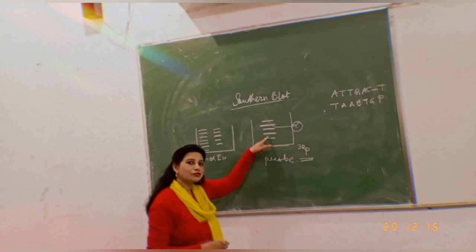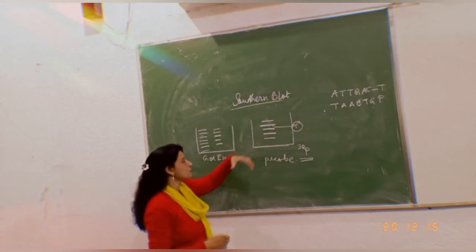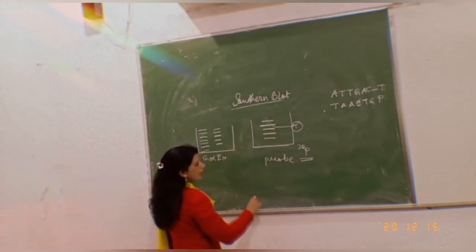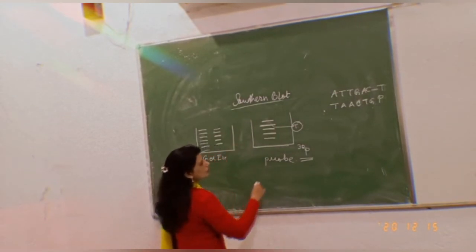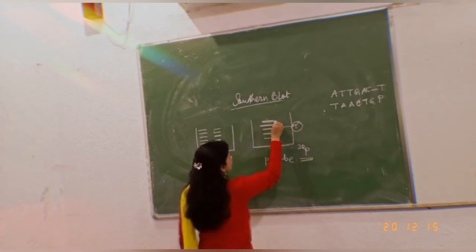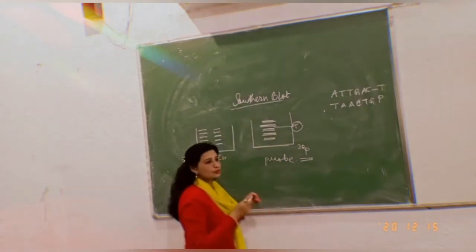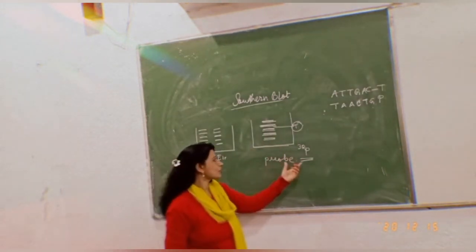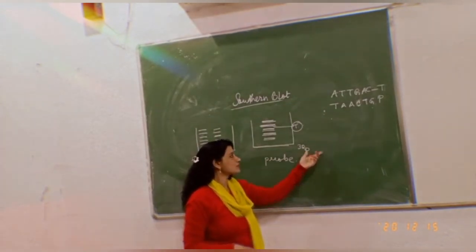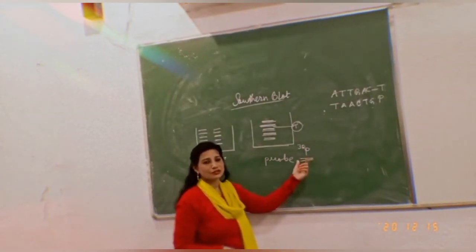Now that means I have to again melt it. That is, the denaturation process has to take place. I will be using a denaturing buffer. This buffer will separate it, making it a single strand. After making it a single strand, I can use my probe, which will make it a double strand. Then I will be using my radioactive isotope. The radioactive isotope cannot be used earlier, because earlier it was a double stranded structure.